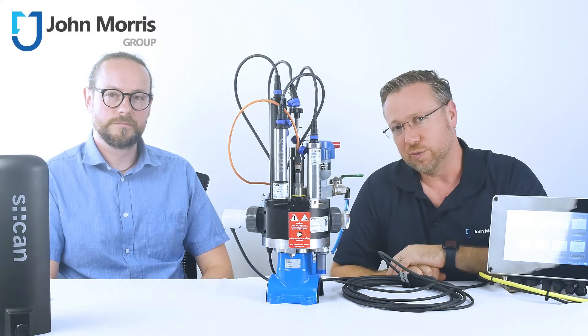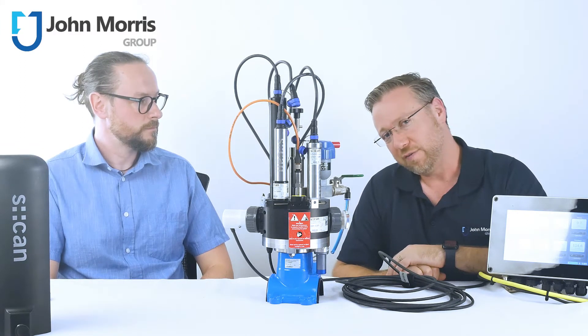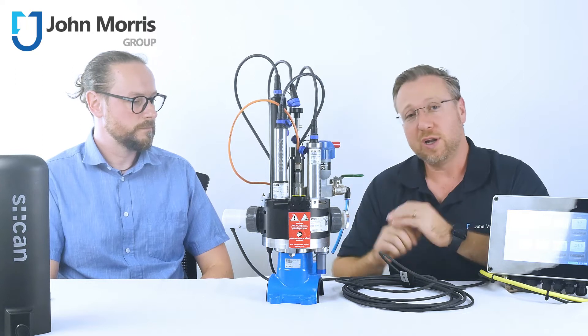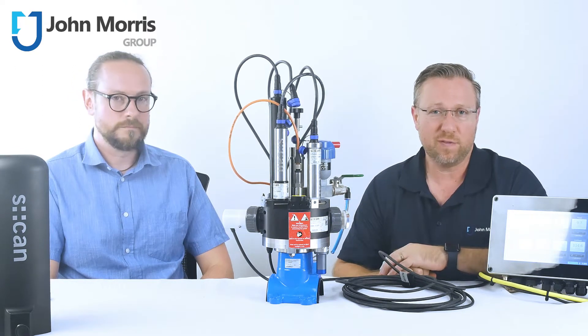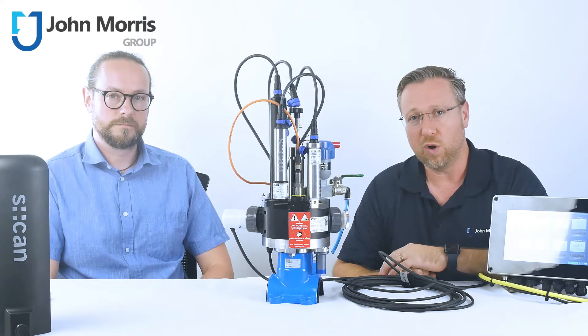Hi, I'm Andre from the John Morris Group and today I'm here with Sven from ESCAN. His organization is located in Austria and they manufacture a range of solutions for environmental monitoring of water quality.